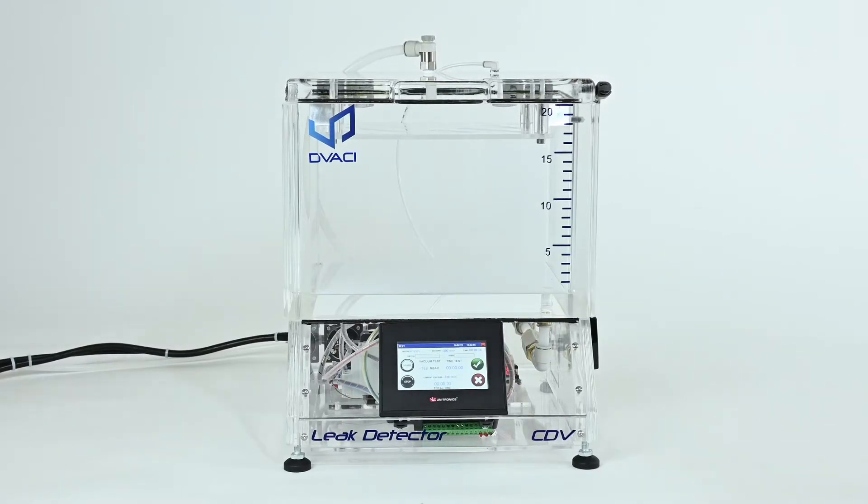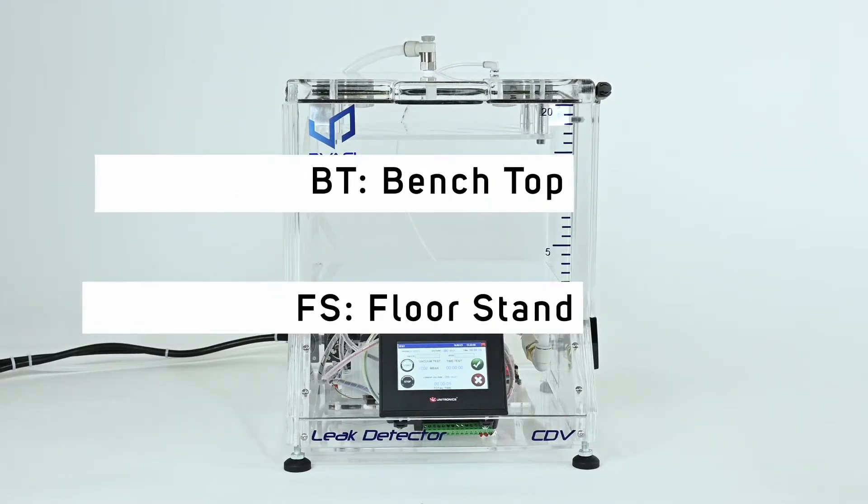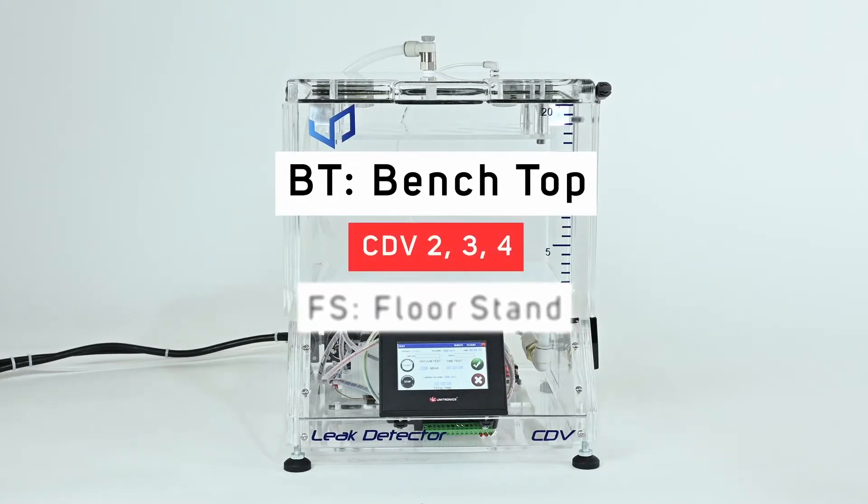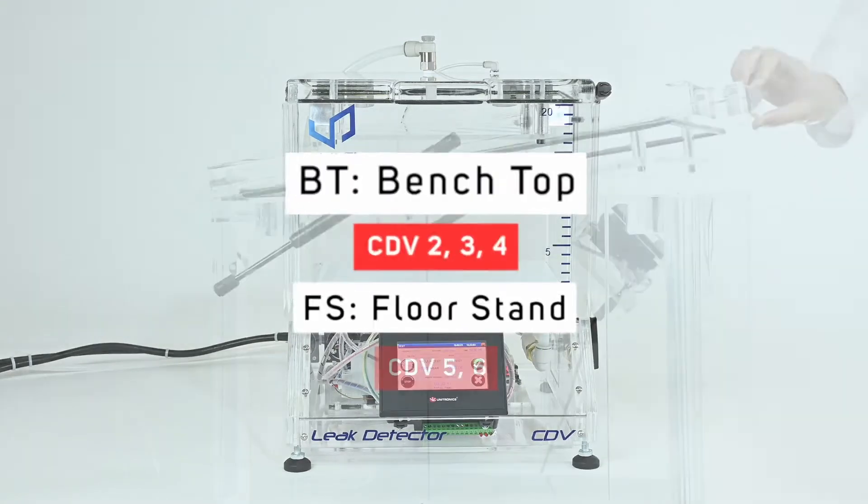We offer five standard sizes divided into two categories: BT, which stands for Bench Top, and FS, for Floor Stand.